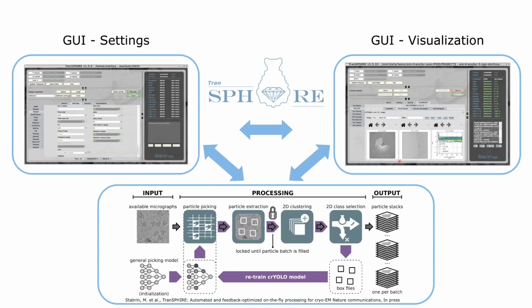So TranSPHIRE itself is separated into three big different parts. The first is the GUI settings. TranSPHIRE has a user-friendly interface, which looks more or less like this GUI here.